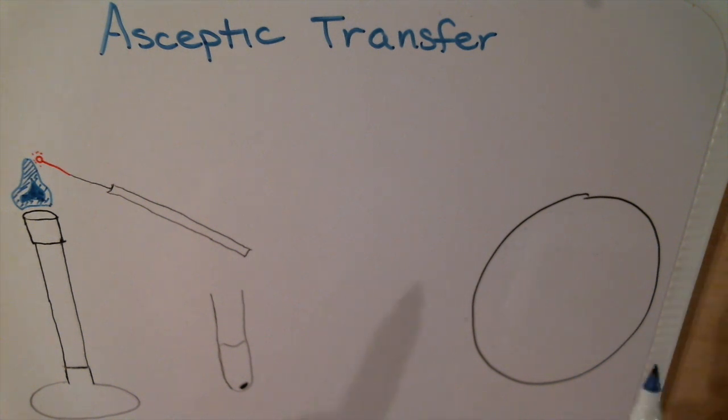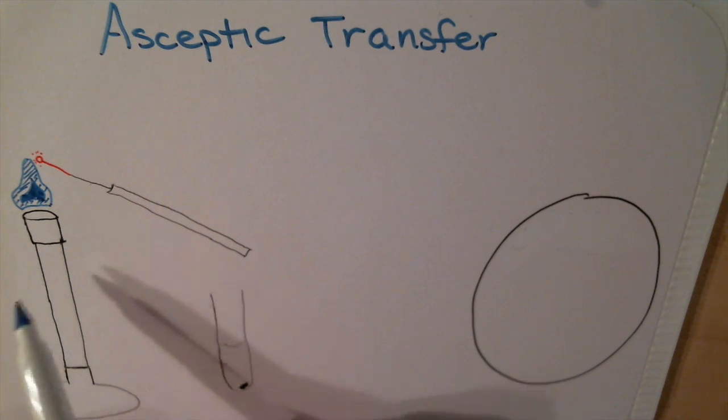When you're doing this, you should always do it within close proximity to the bunsen burner, but not so close that once you're bending over you burn yourself. Please remember that if necessary, you should always turn off your bunsen burner if you have to leave your lab bench. Never leave the bunsen burner unattended.